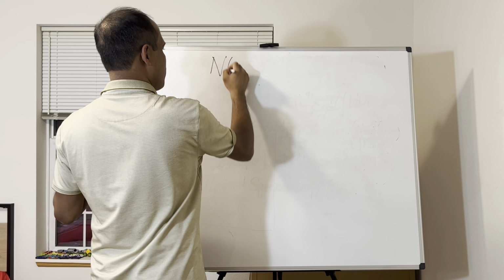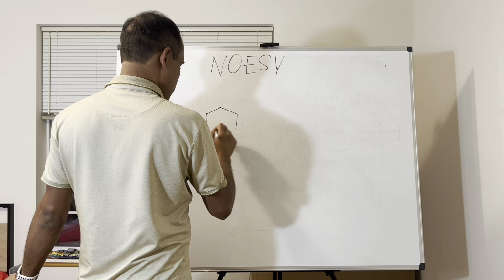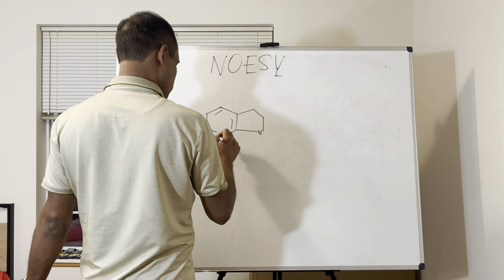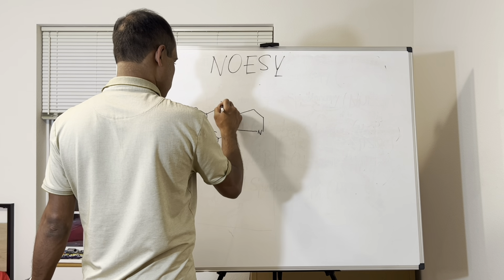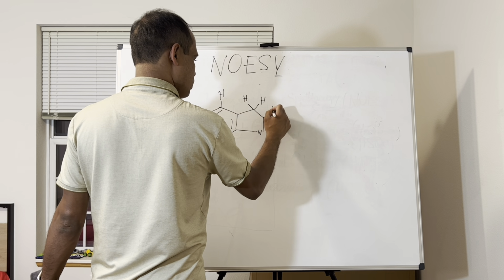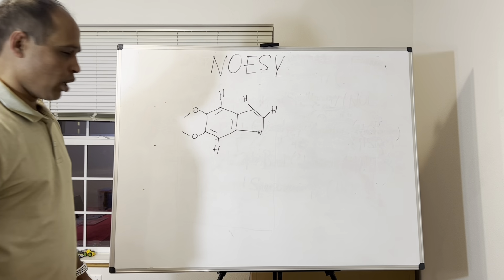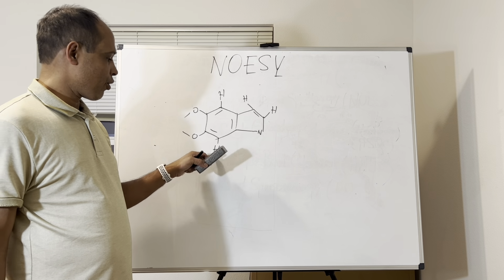So now we are talking about NOESY, okay? Suppose this molecule, you have 2 aromatic protons, like 2 benzene ring protons, okay?